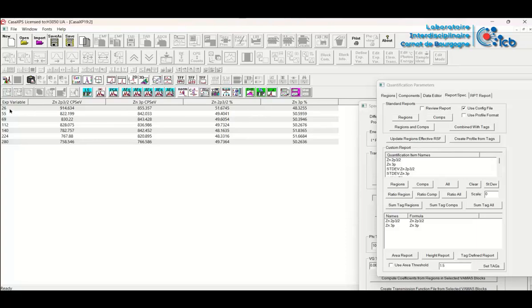Okay, the pass energy 26 is not perfect, but if we look at the area, this is more important. This area needs to be the same, and that is reasonably true for the pass energies that we would probably use for quantification and working with. So we're quite happy now that they are reasonably consistent in terms of area and results.